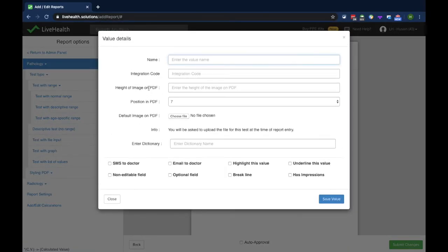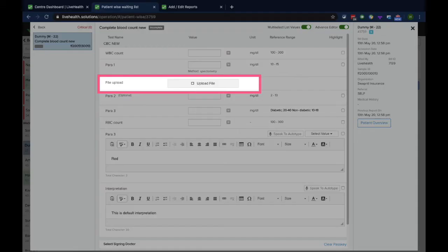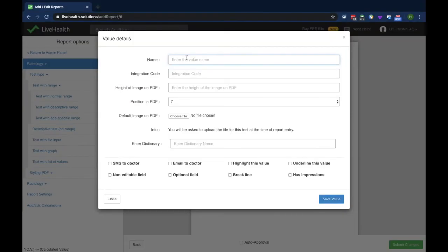Test with file input is for an uploadable parameter. If you want to show an image on the report and want an option for the lab staff to upload an image, you use this parameter type. It will provide an upload option while filling the report.